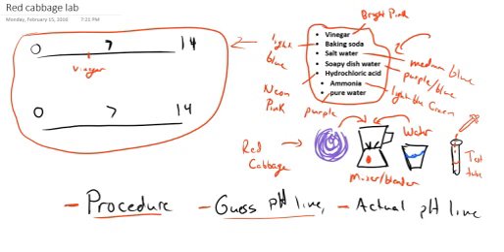It doesn't even change colors. So, just to recap, we started with a purple solution. When I added these 7 things in there, we get a color change ranging from hydrochloric acid at the most extreme pink end down to ammonia at the most extreme light blue or green end. And then pure water winds up somewhere in there. It didn't actually change the color at all. It's almost as if it's not an acid or a base, it's something else.